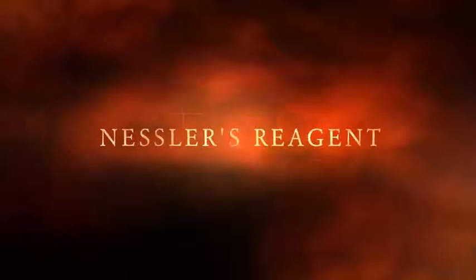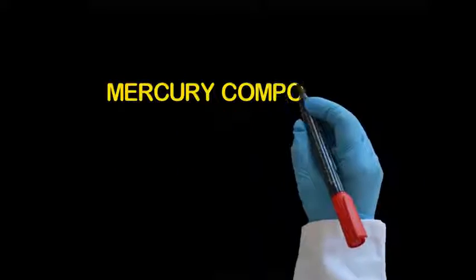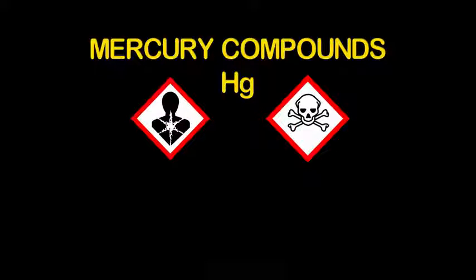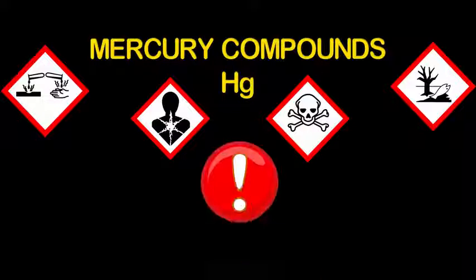Mercury ions are interacting in a peculiar way with the iodide ions. The result of their interaction is the so-called Nessler's reagent. Caution is needed when working with the necessary reagents. Mercury compounds are toxic. The chloride is caustic and harms the environment.